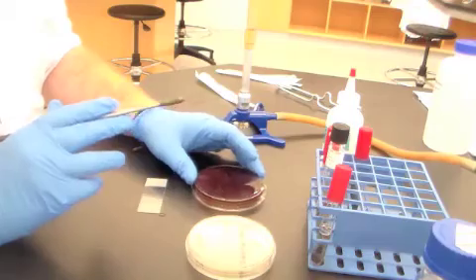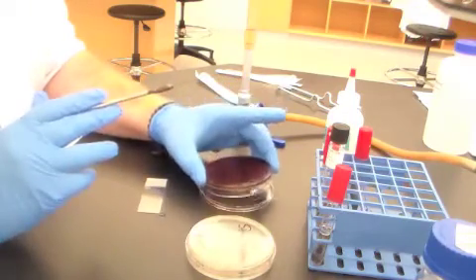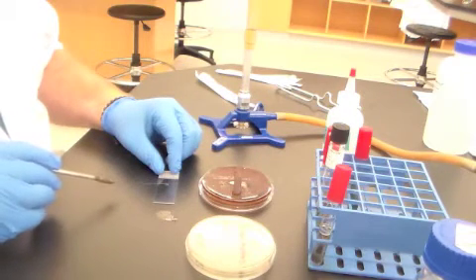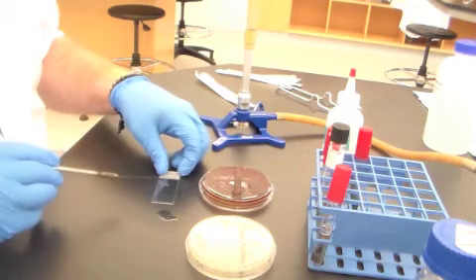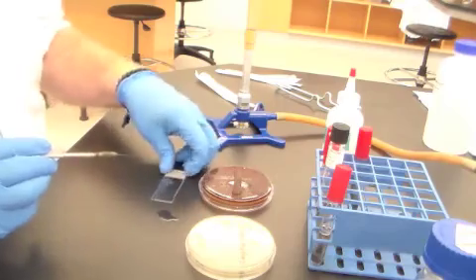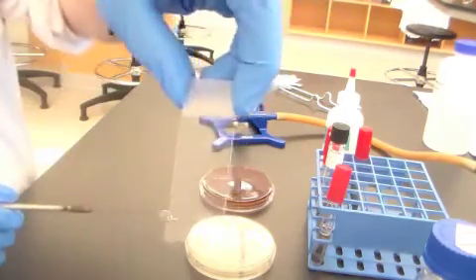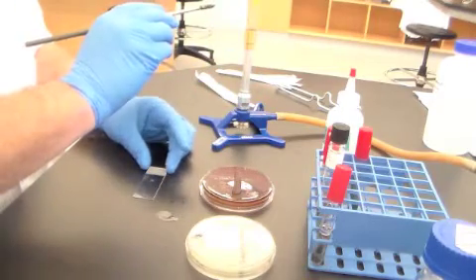So I've taken a little bit of bacterial growth sterilely from this Staph aureus, and I now have a clean microscope slide. I didn't put any water on it, but I'm just going to smear that Staph aureus in a small little spot. I'm trying to get as much of that off of the loop as I can, so that you can see that. A little spot of Staph aureus.